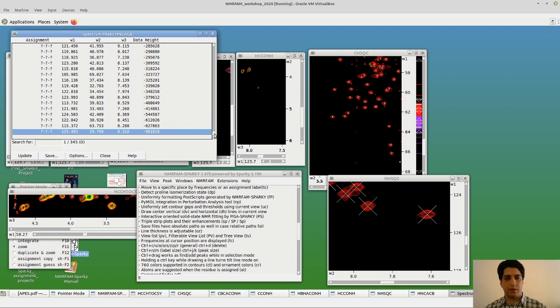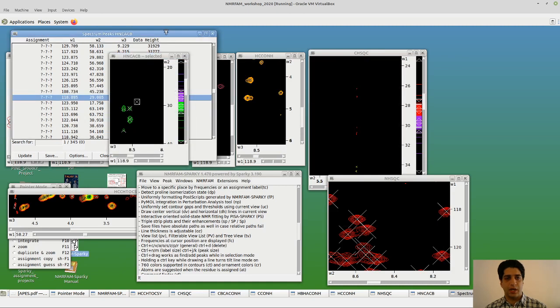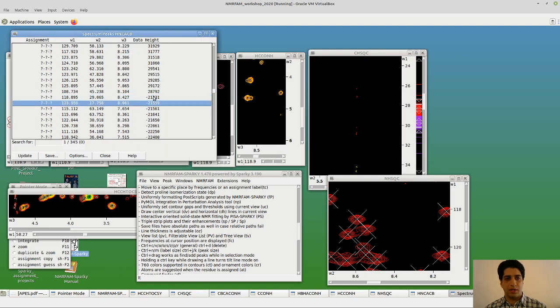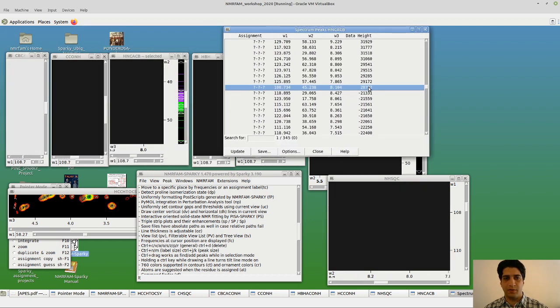So we're not going to do this. We are going to go to the middle, right where we see the change of sign, so around 0. And that is the part that we need to start from, deleting peaks from each side, so this side and this side. So let's start from here.